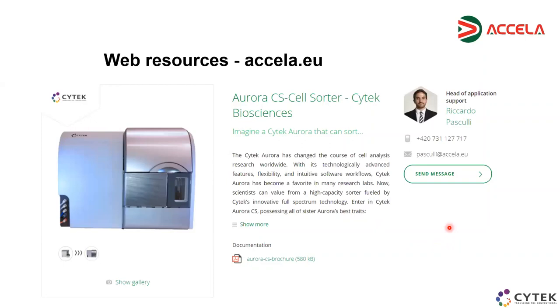I have one question about the sorting. Please. So you mentioned after the question of Naomi that the minimal is like 200 cells, which could be useful to work in the flow cytometry, and approximately 10 to 50 microliter. Is it the same for the sorting as well or not? I don't think so, right? Am I right?